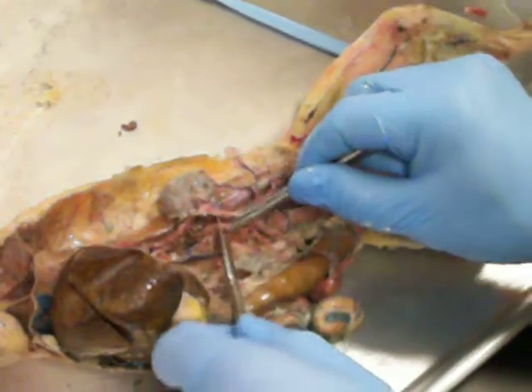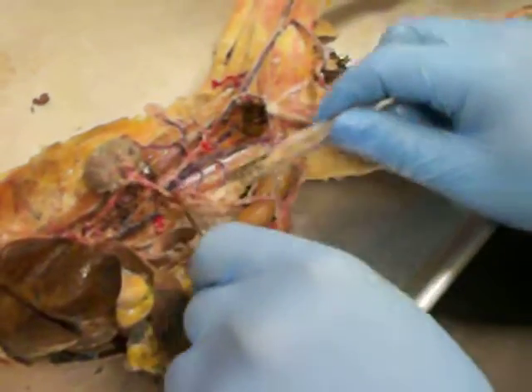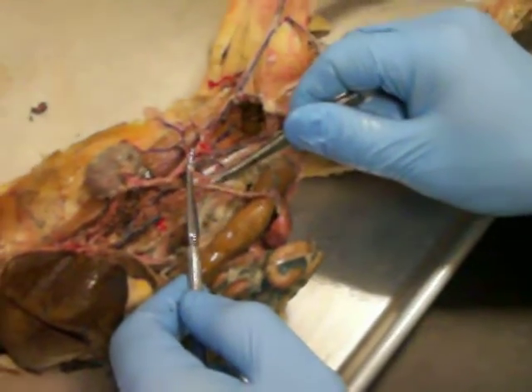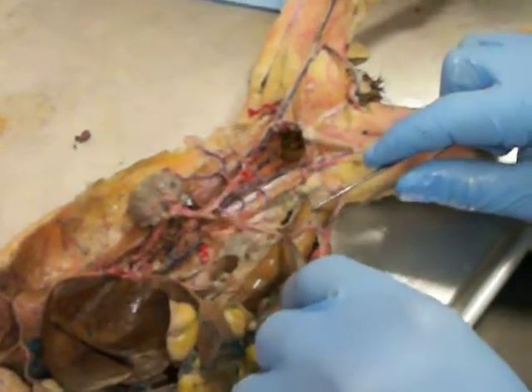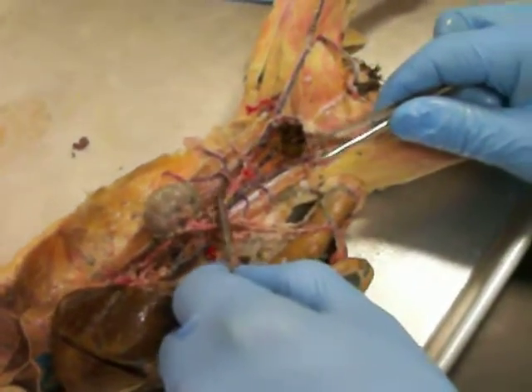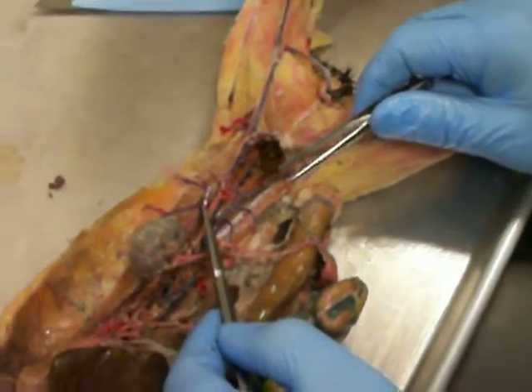Okay, so here is the descending abdominal aorta again. And then our next branch is this one. This is the posterior mesenteric artery going straight over to the large intestine. And then these are the iliolumbar artery and veins.